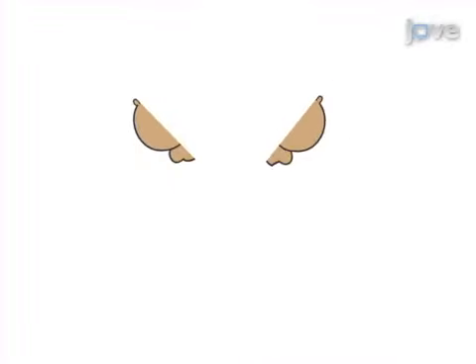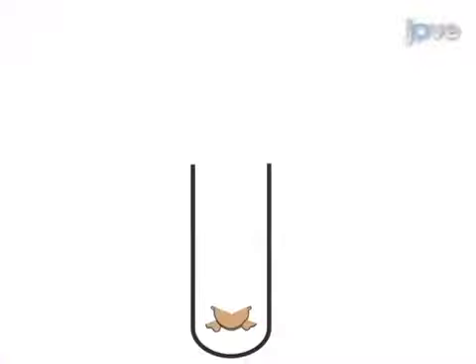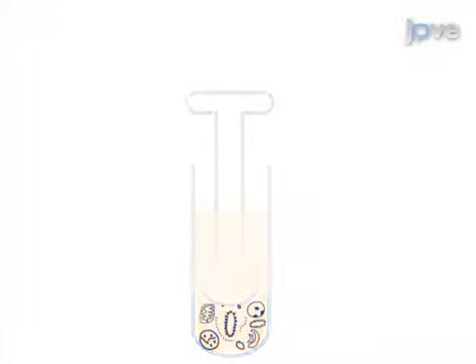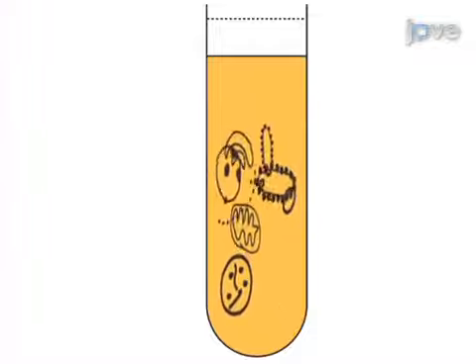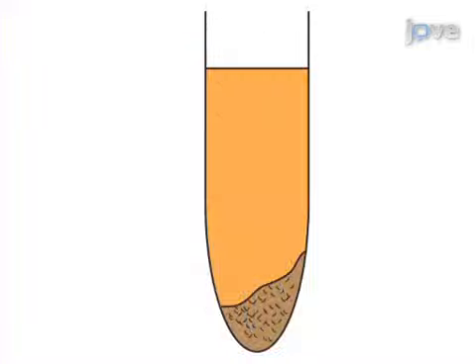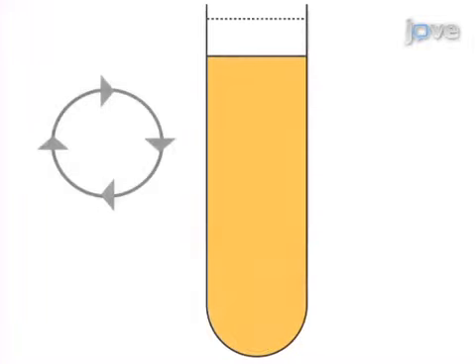This is accomplished by first dissecting the mouse brain, which is then homogenized in a specific buffer using a Dounce homogenizer. The resulting homogenate is centrifuged at low speed to remove nuclei, unlysed cells, and debris.